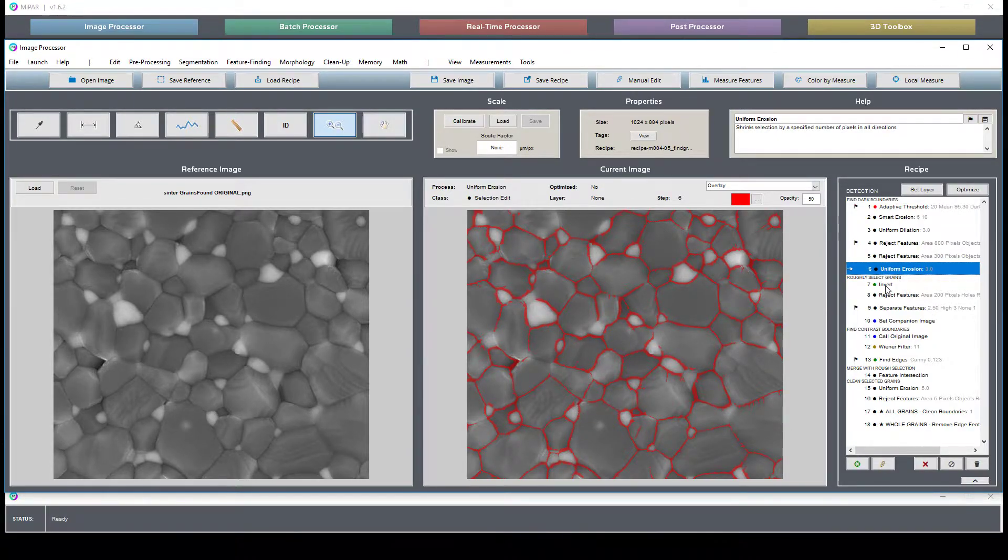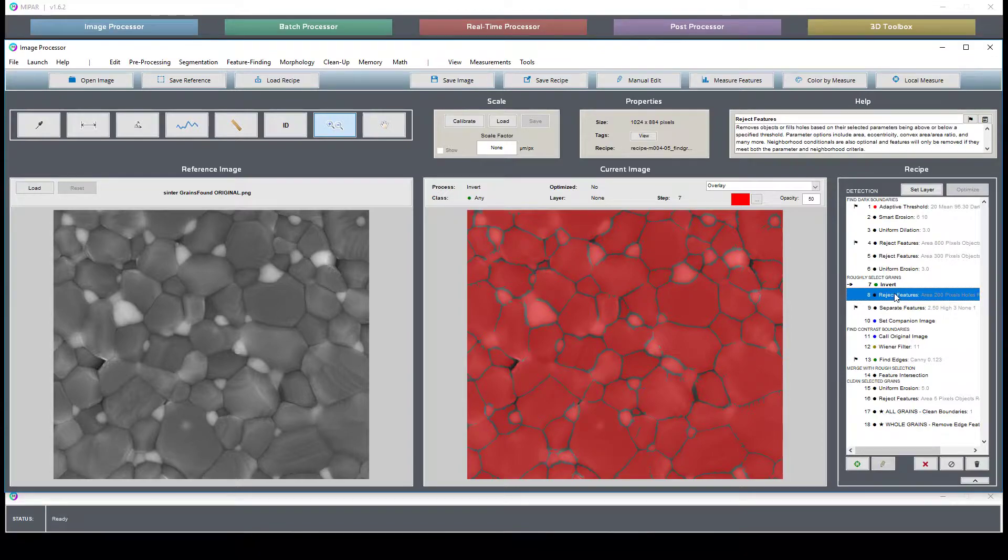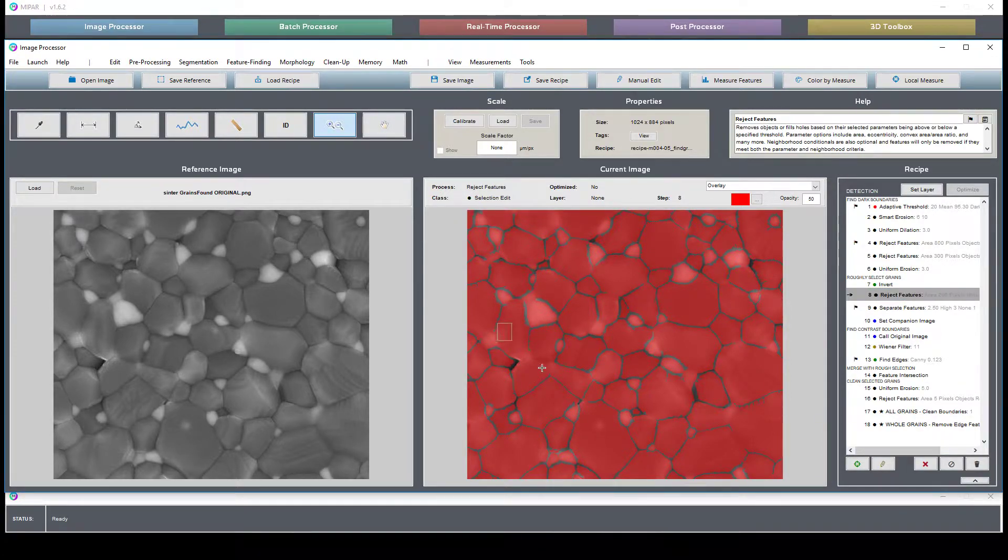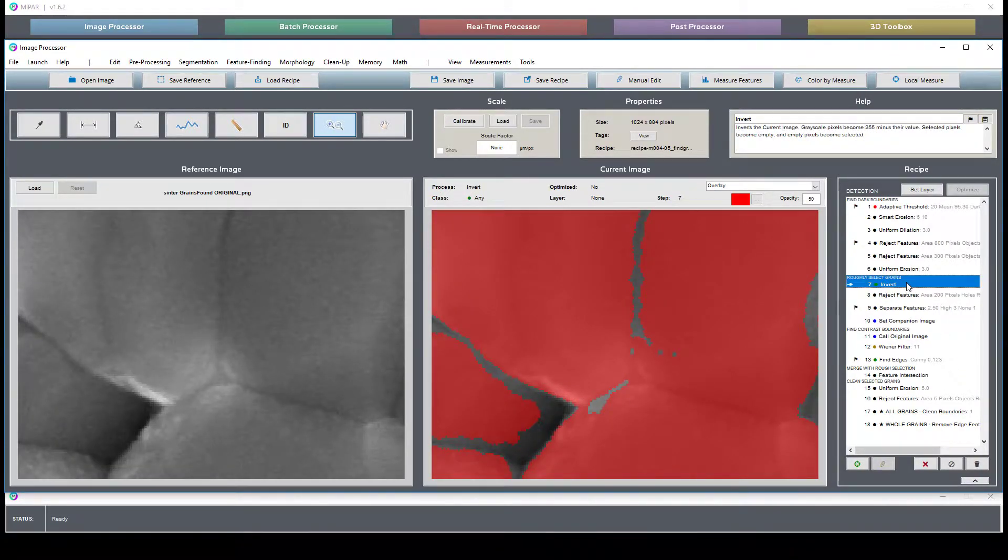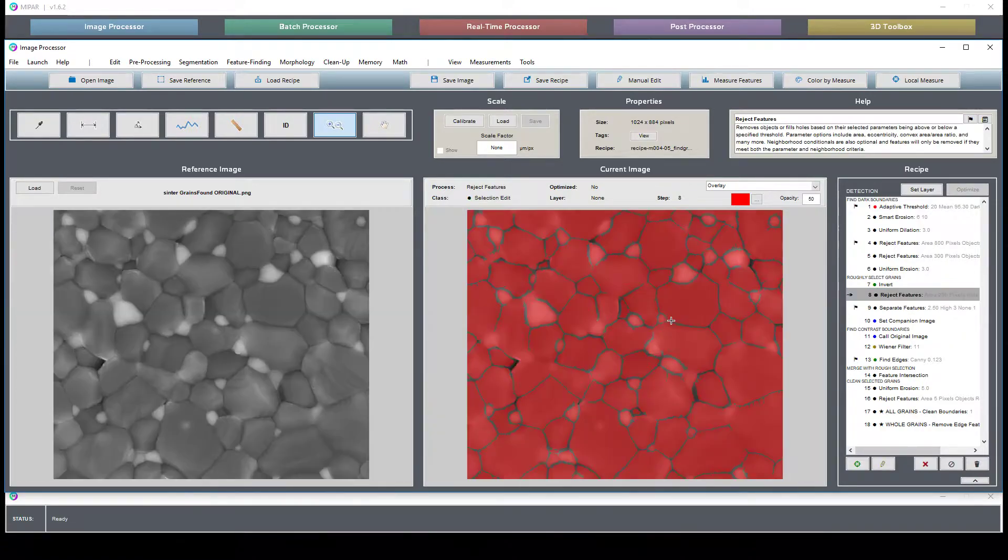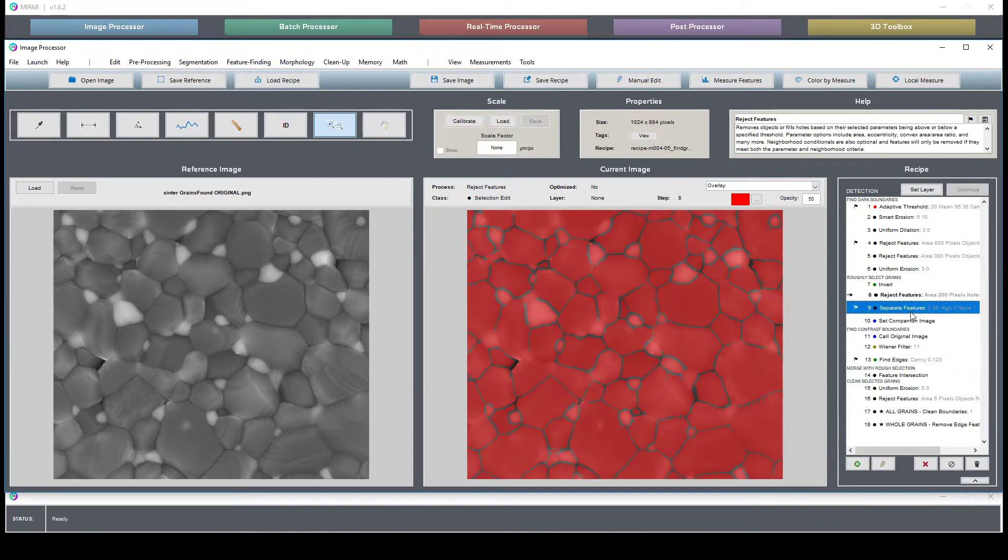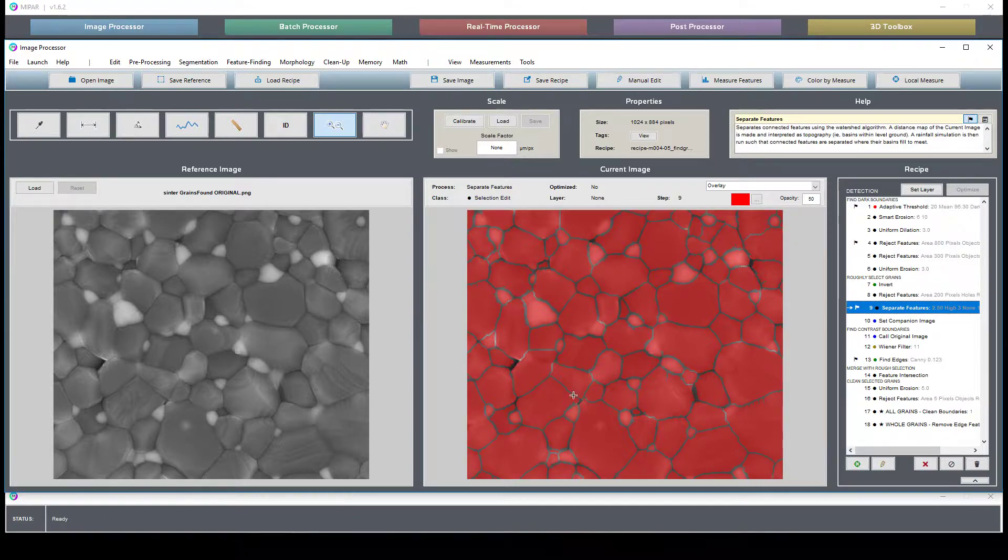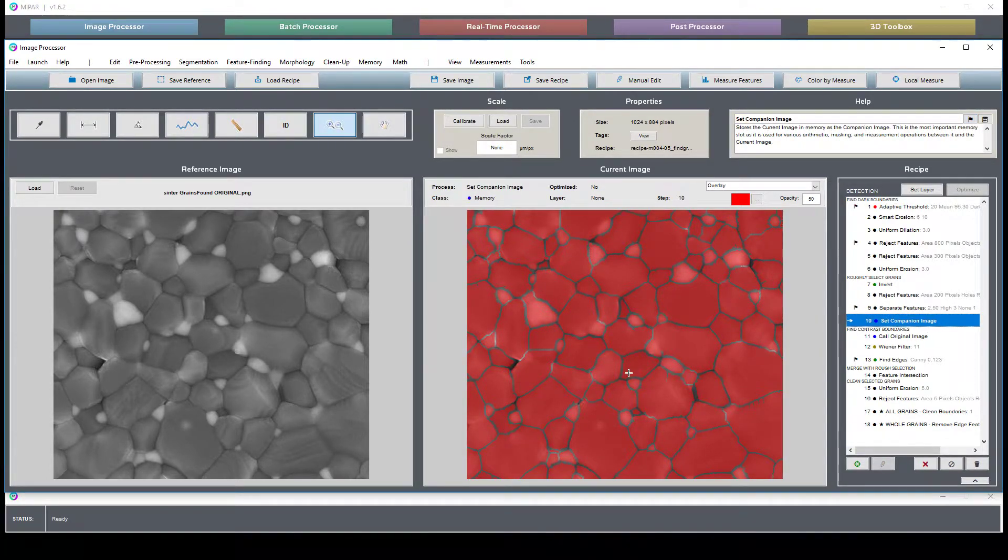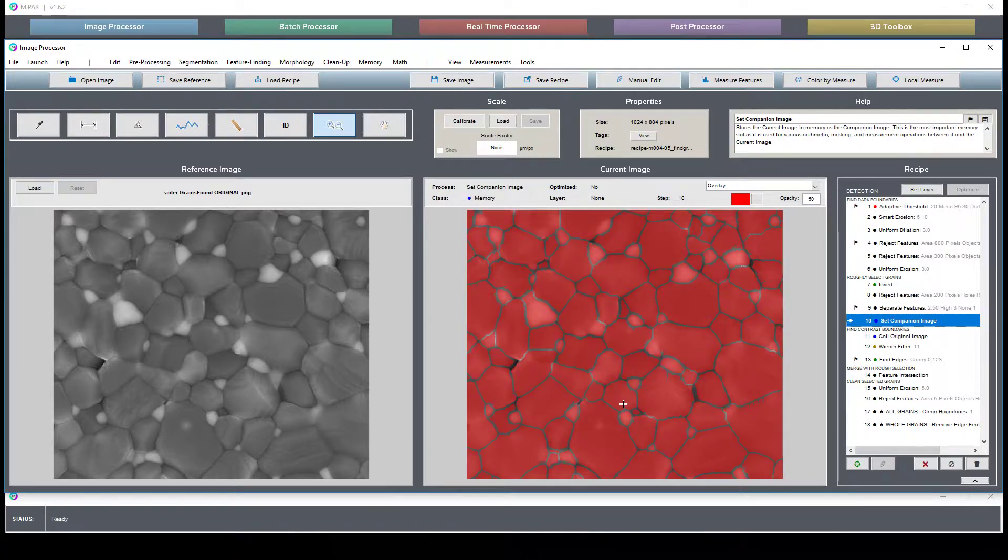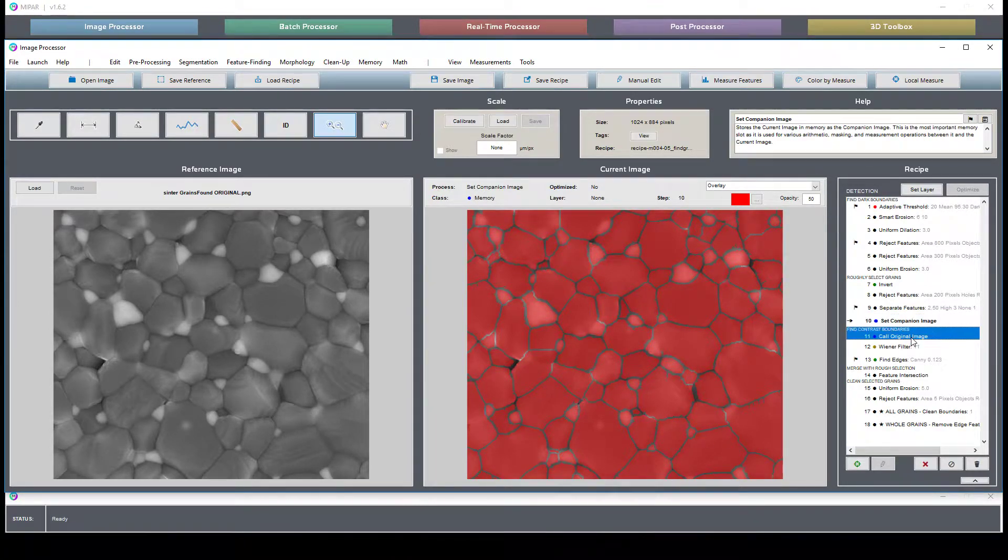What we're then able to do is do an inversion, clean up some of these irregular holes, and then run a separate features to clean up this selection. So this really helps us interpret where grains begin and end.